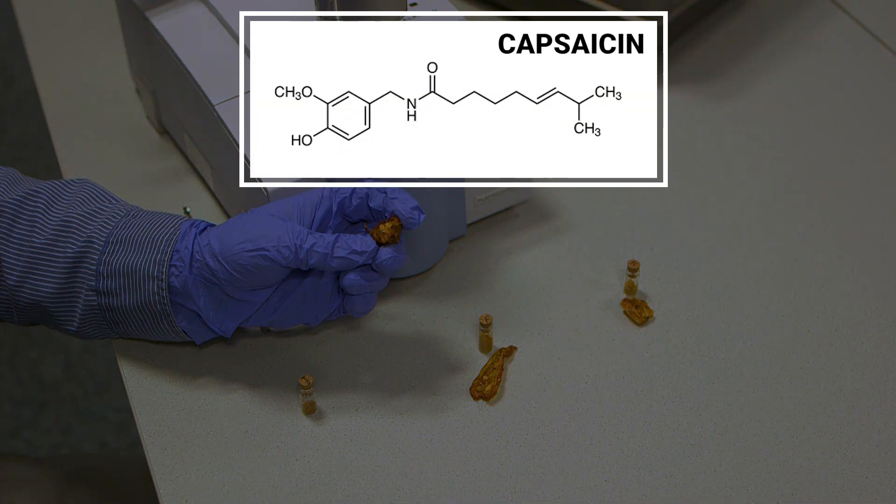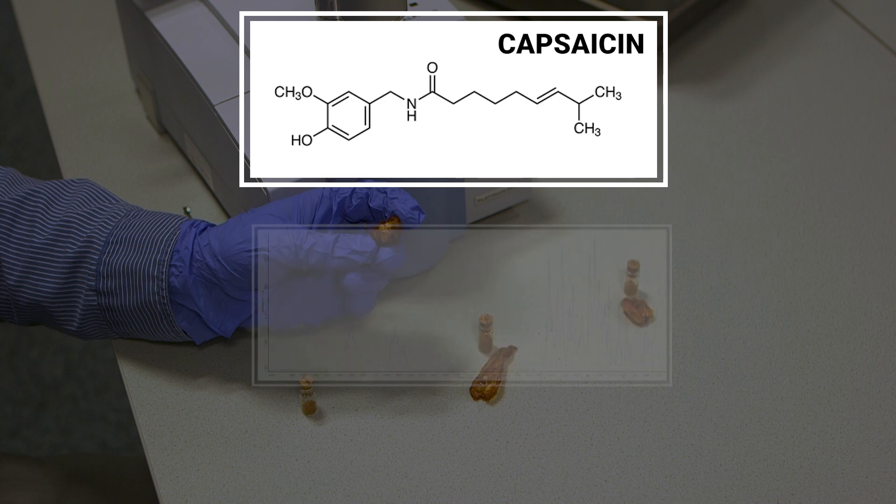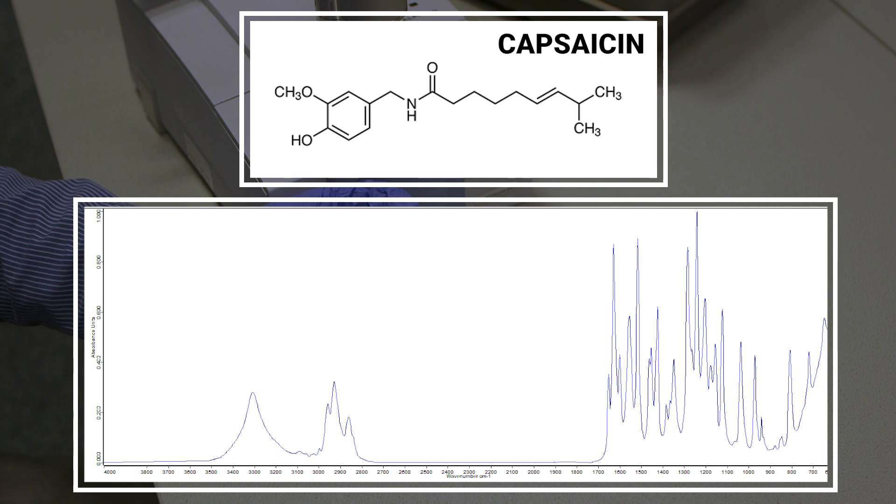Capsaicin is the main component of a chili fruit that gives you this unique feeling of hotness, and it features a quite characteristic infrared spectrum.